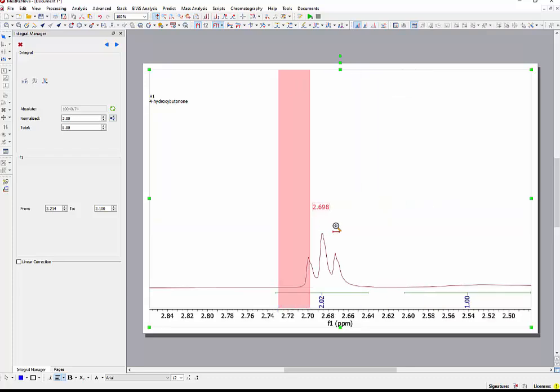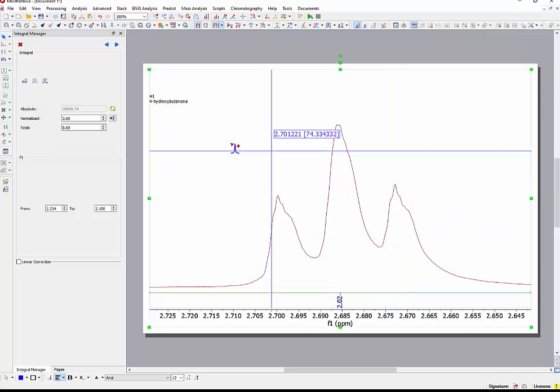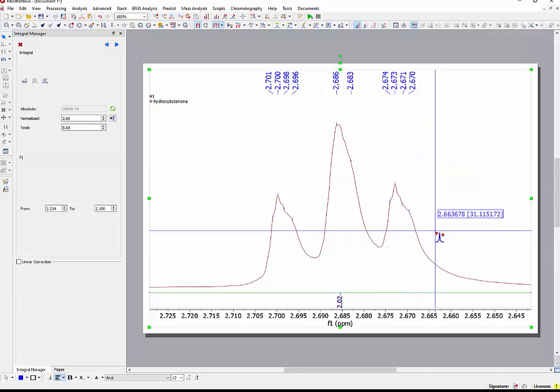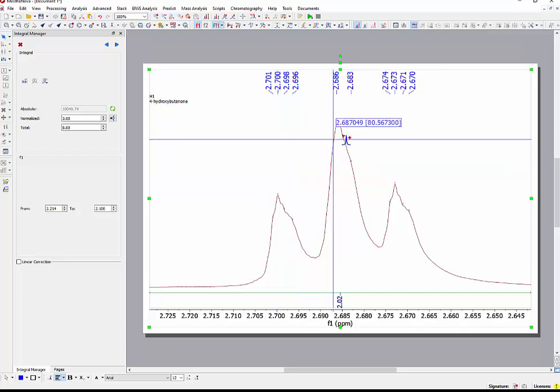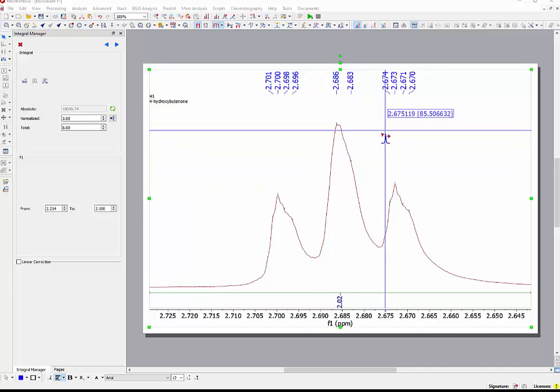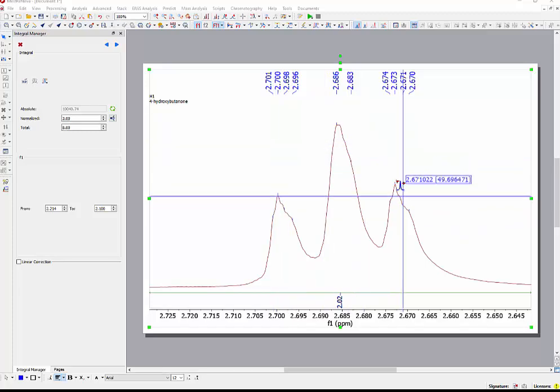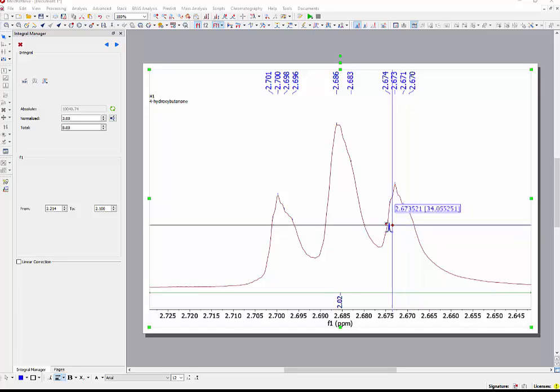If I use the zoom tool, Z, then I can once again zoom in here, and now I can peak pick across all three of these, and lo and behold, it is choosing a whole bunch of things as real peaks, including some that I wouldn't necessarily want. I imagine this to be here, here-ish, and here for the actual main peak elements. One of the points that I'm making throughout the document is that you cannot necessarily trust the computer. To human eyes, this clearly has three main peaks, but all of these little sub things don't necessarily count. So don't just blindly trust the computer.